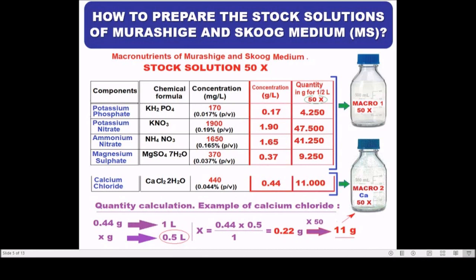To prepare stock solutions of macronutrients, we must consider the problem of precipitation and then prepare separately two stock solutions: the first stock solution 50X contains potassium phosphate, potassium nitrate, ammonium nitrate, and magnesium sulfate. The other stock solution 50X concerns calcium chloride.